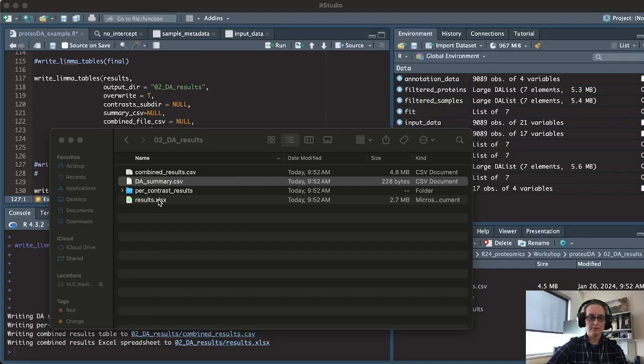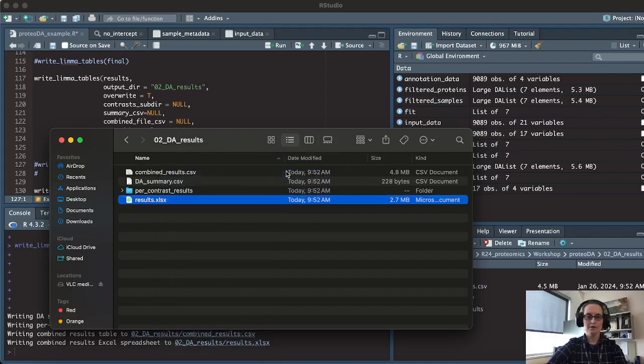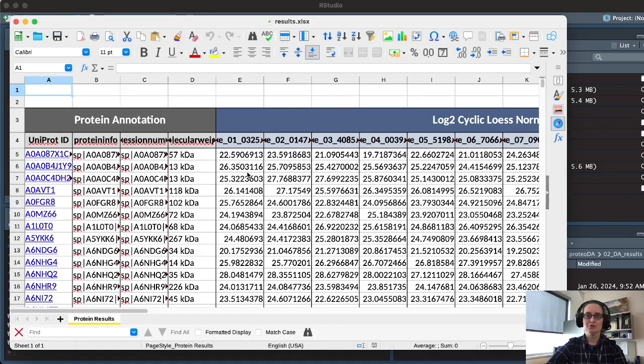But the results, going to open here. This is real life demo going on.